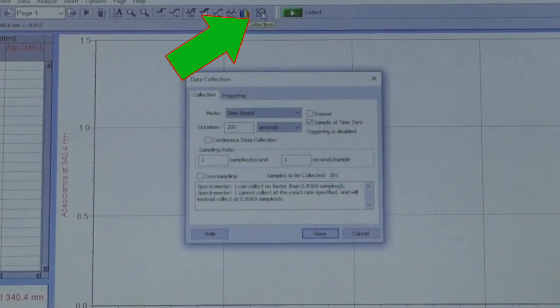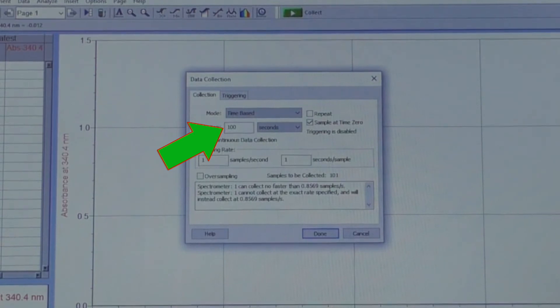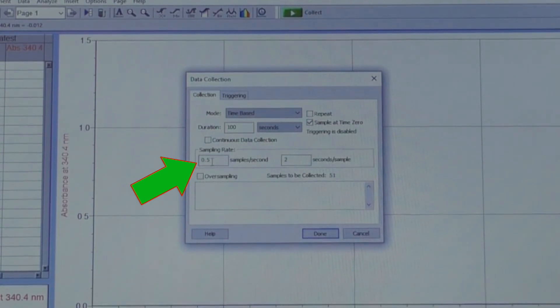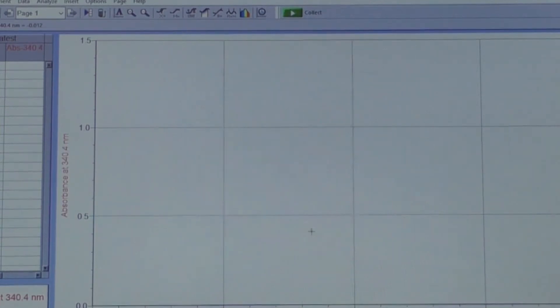Now click on the Clock and Graph icon. The Data Collection window will open. Check that the mode is time-based. Change the duration to 100 and make sure the units are in seconds. Change the sample rate to 0.5 samples per second and check that it states 2 seconds per sample. Make sure the sample at time 0 box is checked. Click Done to save your settings.